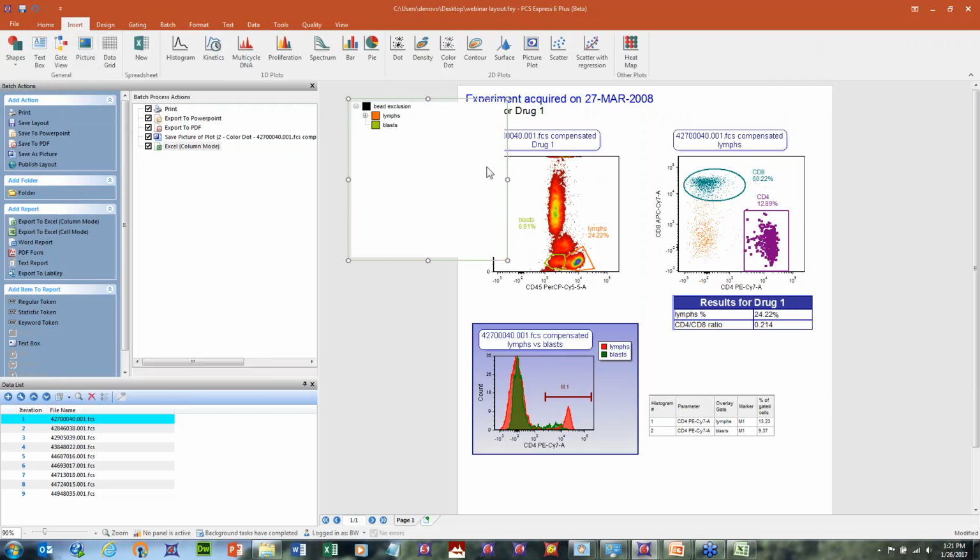And we have several gates already. So we have 5 or 6 gates here. So if we were to export 6 gates times 20 stats, you'd have 120 columns of stats. And that's why FCS Express doesn't export all your stats by default, because then you'll get a spreadsheet that's really too large to make sense of at a glance. So instead, what FCS Express has you do is define the stats that you want to export right now. Okay, and you can always change it later.